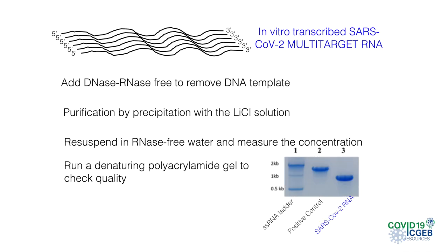To determine the concentration of the transcribed RNA, we quantify using UV light with a NanoDrop, and analyze the quality of the RNA by running an acrylamide urea denaturing gel. We stain the gel with methylene blue and wash with water. Here we can see in the third lane the SARS-CoV-2 RNA, and in the other two the positive control provided by the kit and a molecular weight marker.